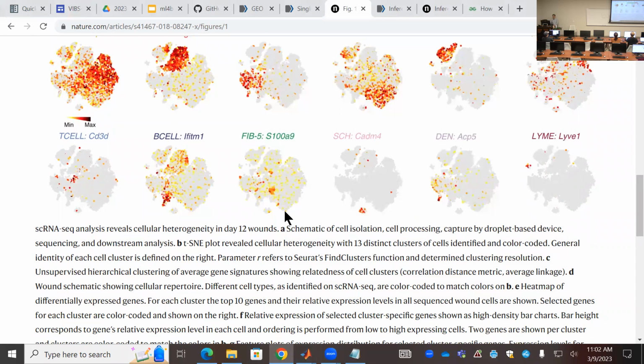I think they only show one marker gene. They probably just use one marker gene. Yeah, but for illustration purpose, they just pick the top one. They believe it's strong evidence. But of course, we shouldn't just use one marker. We should use more.